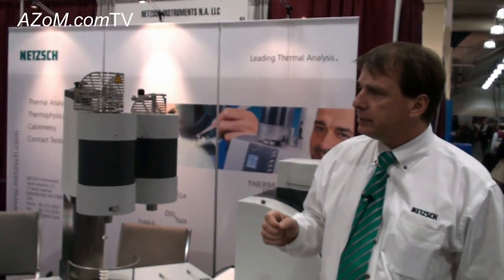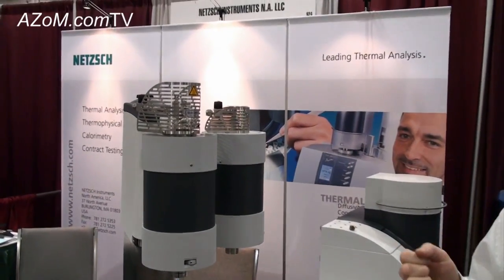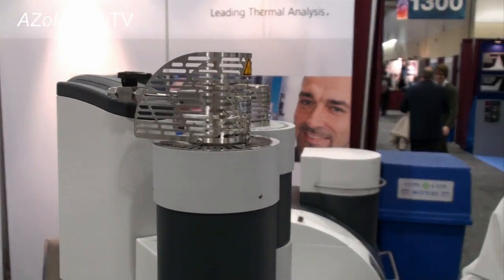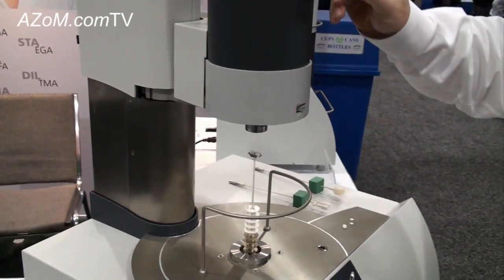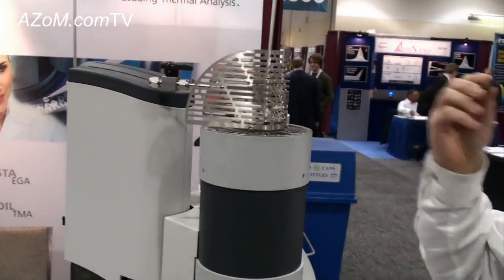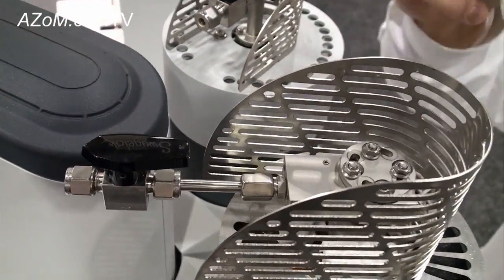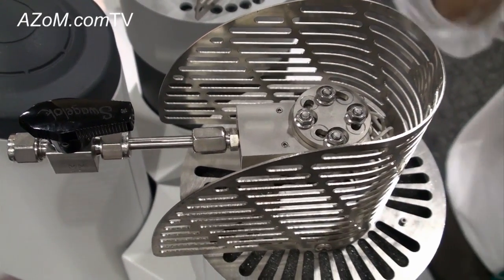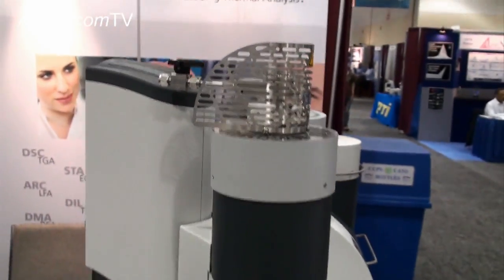Another nice feature is that we can connect any gases that come off the sample to a mass spectrometer, an FTIR, or — new for us — a GC mass spec. In this instrument, the gas flow rates are upward. Anything that comes off the sample is either vented to a hood, or if connected to a mass spec, FTIR, or GC mass spec, we have a heated adapter head to prevent condensation, and then the material is transferred via a heated transfer line.